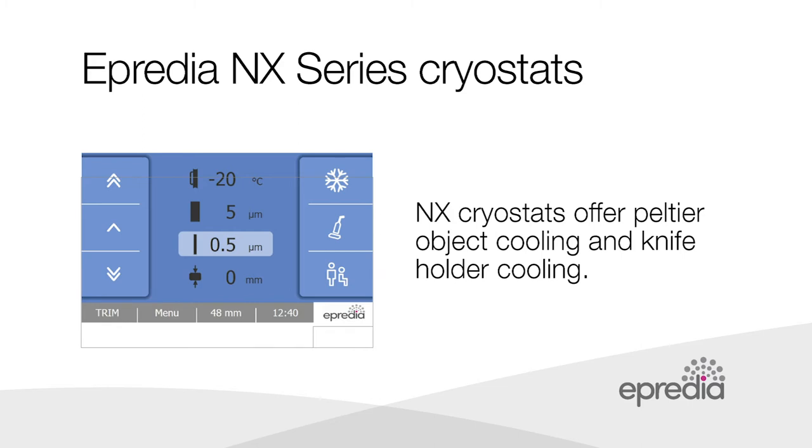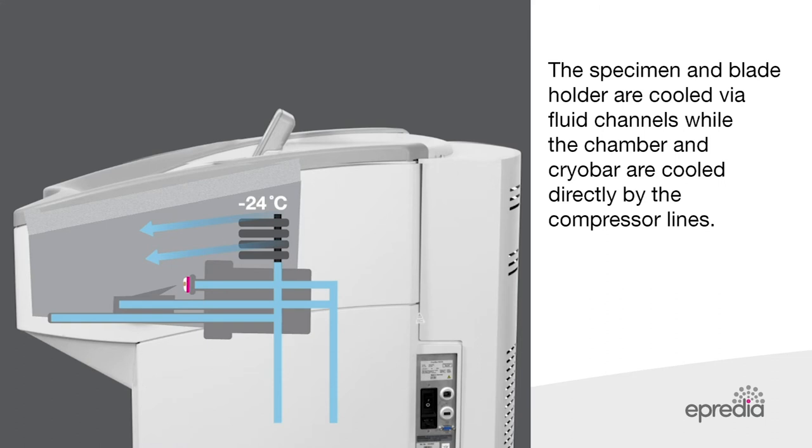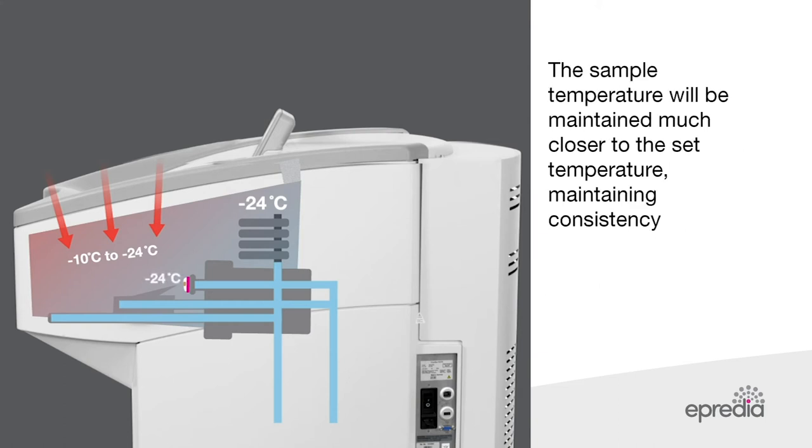The NX50 from Apredia maintains consistent sample temperature with a rapid response control system. The NX50 keeps the chamber air cold, but the rapid response temperature control system actively cools all surfaces that the specimen comes into contact with. The specimen and blade holder are cooled via fluid channels, while the chamber and cryobar are cooled directly by compressor lines. Instead of being passively cooled by air, the sample is actively cooled by the metal surfaces it is pressed against. When the chamber is opened, warm air may change the chamber temperature, but it will not affect the actively cooled surfaces to the extent of conventional cryostats. The sample temperature will be maintained much closer to the set temperature, maintaining consistency.